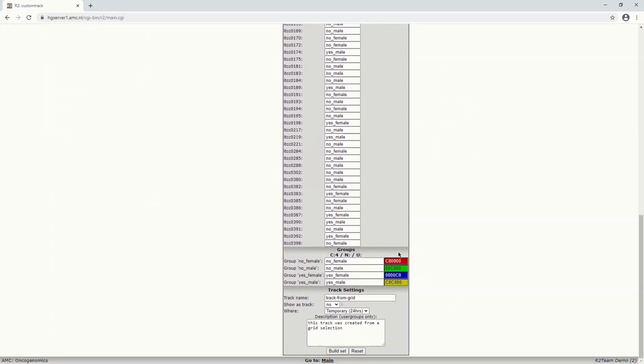Over here, underneath the samples, you can choose a color, and also you can adapt the labels. So we could add MYCN to every label for us to have a more clear idea about the values. We can also rename the track. This is MYCN amp underscore gender.